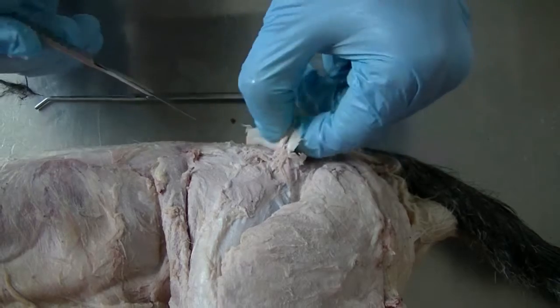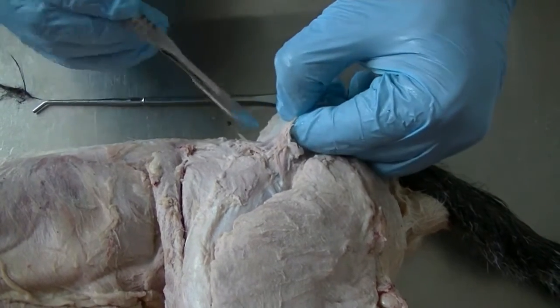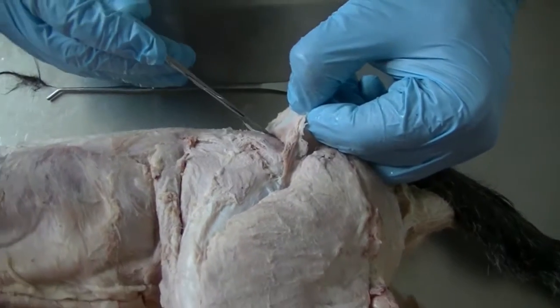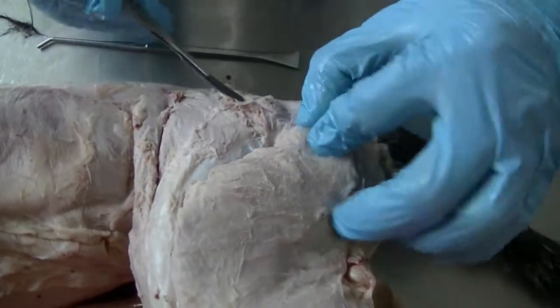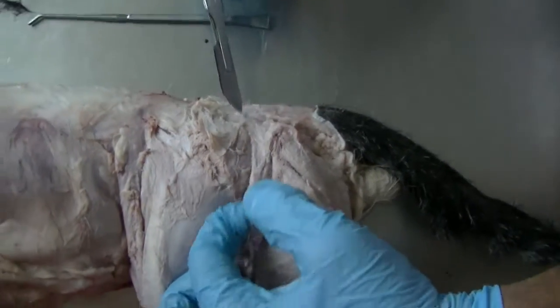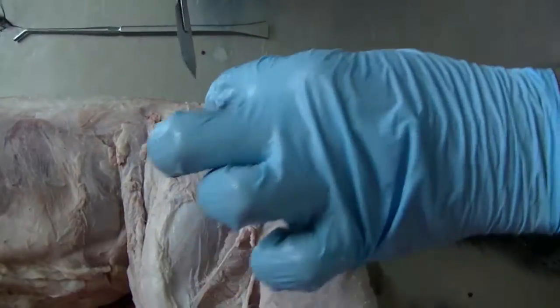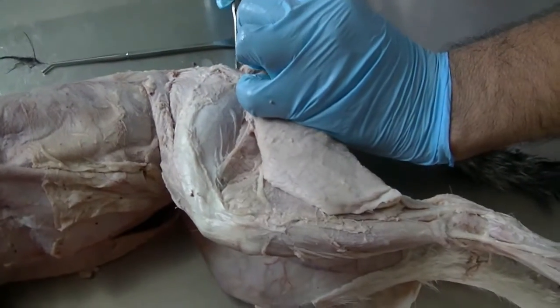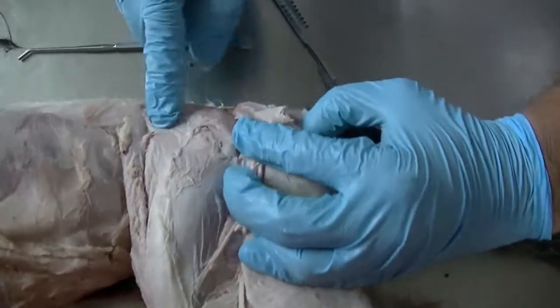As I reflect the gluteal fascia along with the superficial gluteal muscle, we can notice the superficial gluteal, which is different from the cranial crural abductor that we saw earlier. I'm going to transect much of that so we can see the middle gluteal clearly.